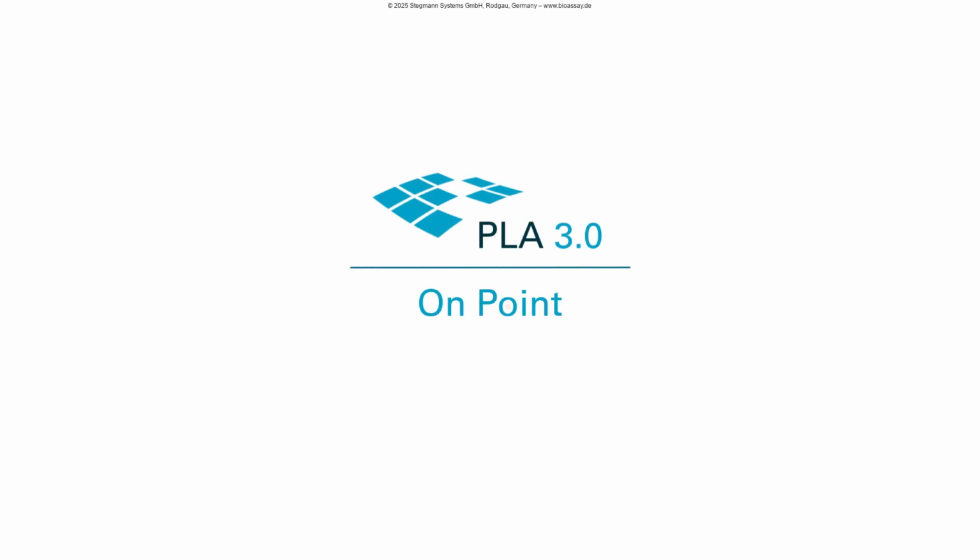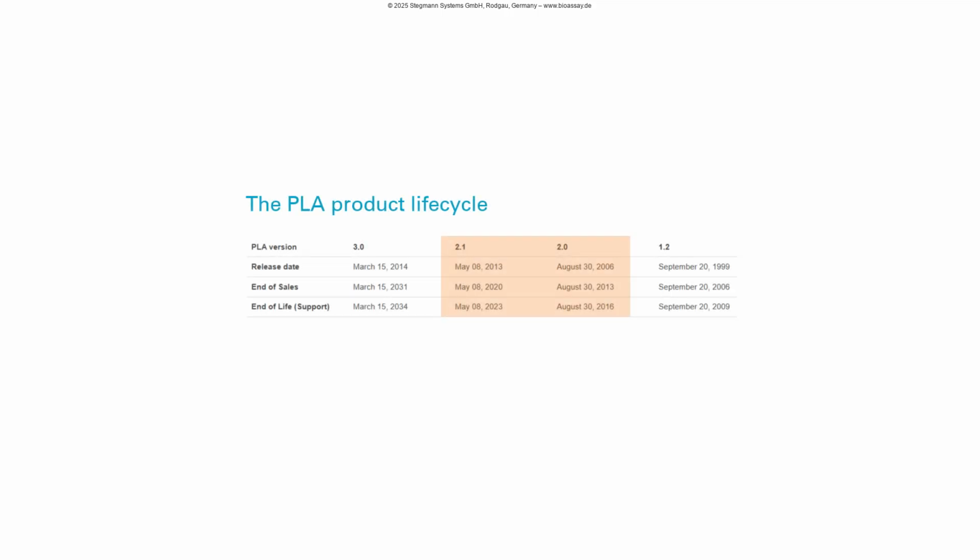PLA on point. In this video, I show how to compare PLA 2 results with PLA 3.0. PLA 2.1 reached its end of life a few years ago, making it increasingly important for customers to migrate their PLA 2 assay data to the state-of-the-art PLA 3 environment.